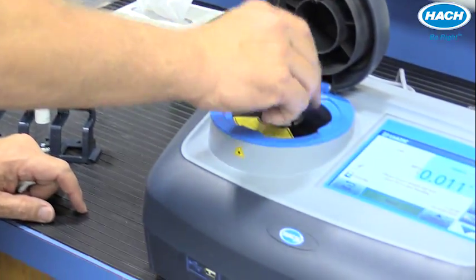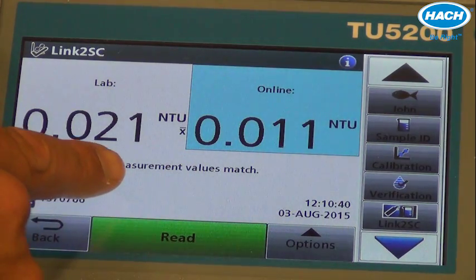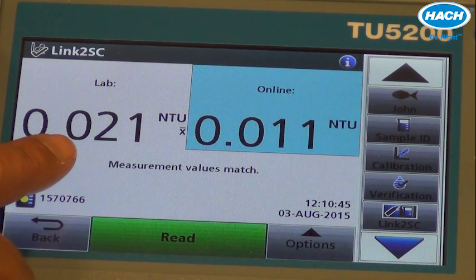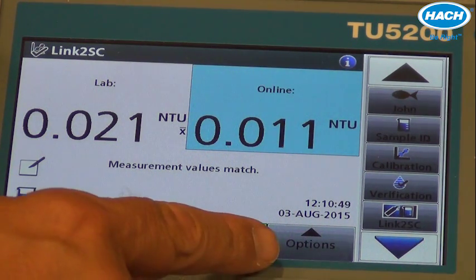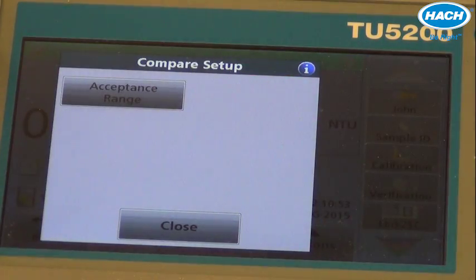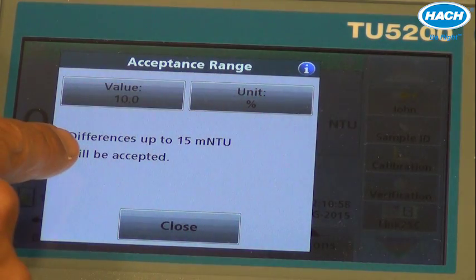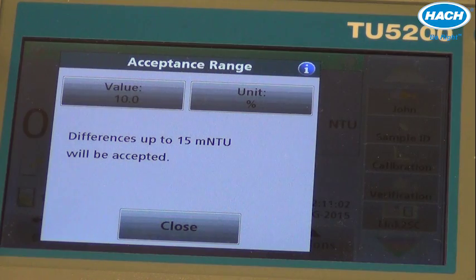Open up the lid and place the vial in. Notice the information is stored, and in this particular case, the numbers meet the matching criteria set within the TU5200. That can easily be changed by pressing the options and the compare setup. The acceptance range is, by default, 10%, but notice differences up to 15 milli NTU will also be accepted. The user can change this depending upon their needs.